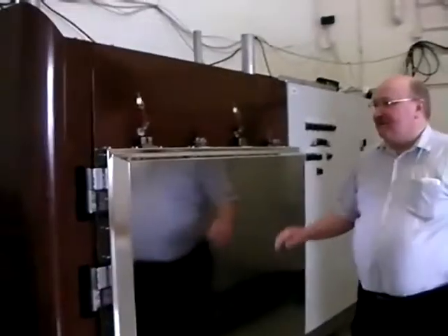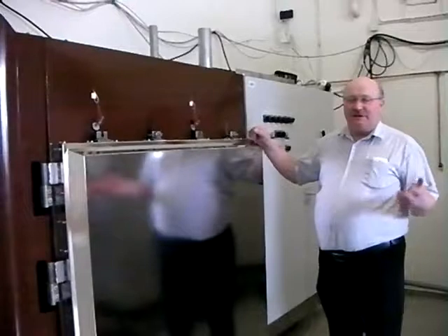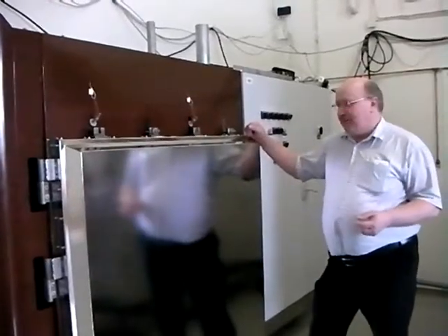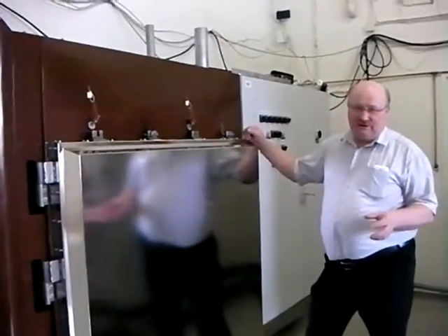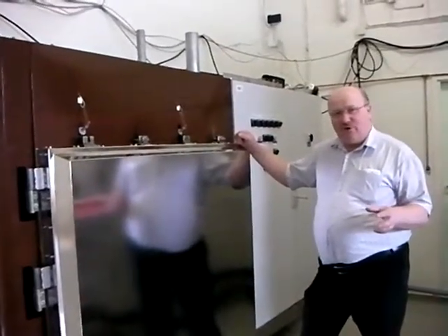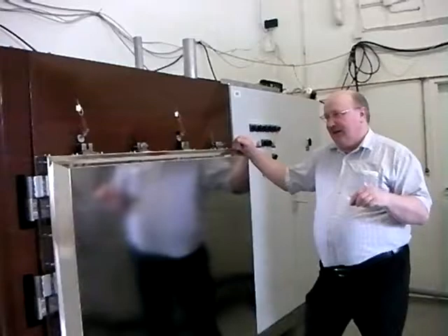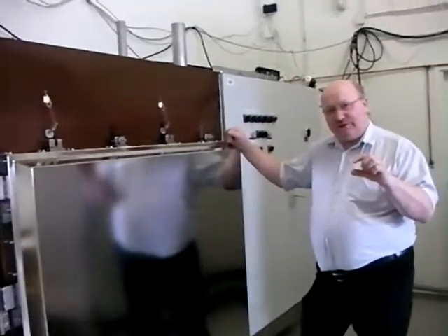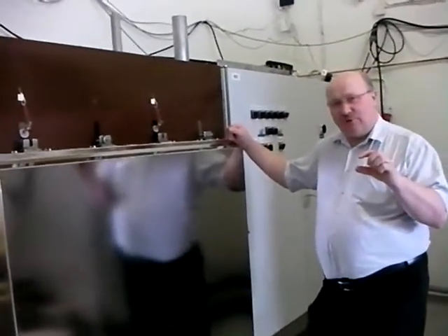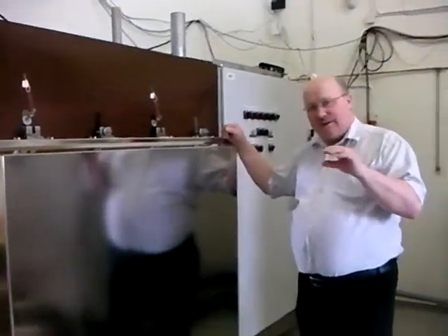With these small laboratory kilns we treat small pieces of wood before starting treatment in industrial kilns. In that way we can develop the recipe for all new wood species, all different thicknesses and dimensions, and different initial moisture contents. When the recipe is first developed with the laboratory kilns, we can guarantee the quality is perfect when it is treated for the first time in the industrial kiln.